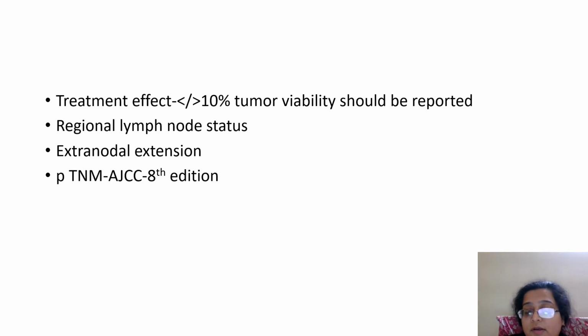Then if your specimen, nowadays there is a lot of the concept of neoadjuvant chemotherapy. So if the specimen is coming to you after treatment, then this problem of necrosis and tumor viability will come. You take similar sections. Also take sections from areas that look soft and pulpy. Soft and pulpy means there's necrosis there. So you might take of course from necrosis and we can see yes, 10% viability of cells is there or not on microscopy. Also try and take sections from areas which are firm. It is always better to take sections from areas which are firm, as well as of course the necrosed area, to get a complete view of what the tumor type might be in that section.